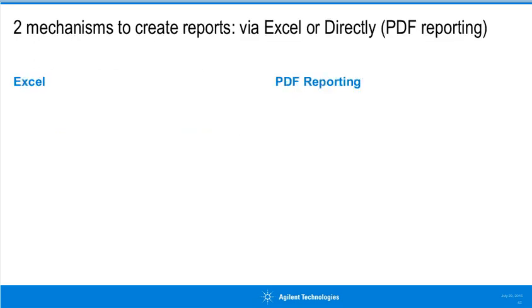So to conclude the reporting section of today's conversation, I thought it would be useful to summarize the two reporting approaches. From an Excel perspective, Excel-based reporting is fully supported in MassHunter quantitative analysis and will continue to be supported for many years to come.